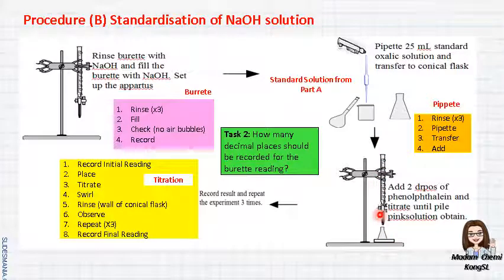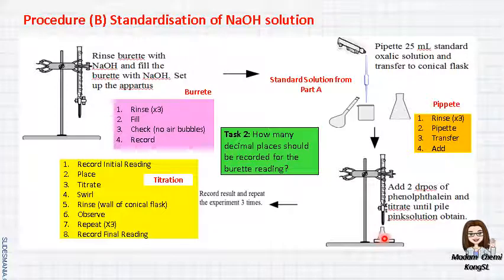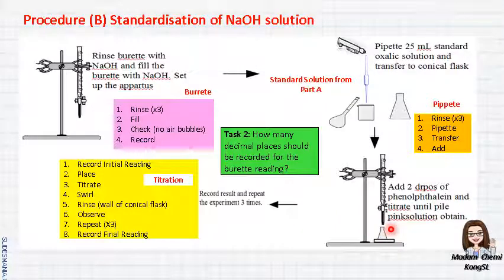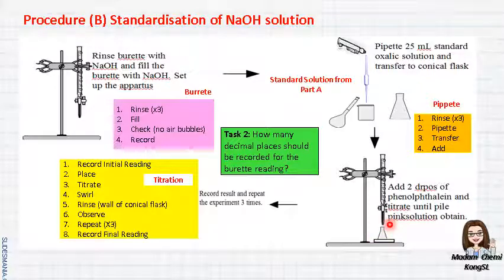Then you can start to titrate. During titration, you have to swirl the conical flask. At the halfway point, you can stop a while to rinse the wall of the conical flask with distilled water to ensure that all the sodium hydroxide mixes with the oxalic acid. From time to time, observe the changes in color of the solution — is it starting to change to light pink or light purple? If yes, you have to continue your titration drop by drop.